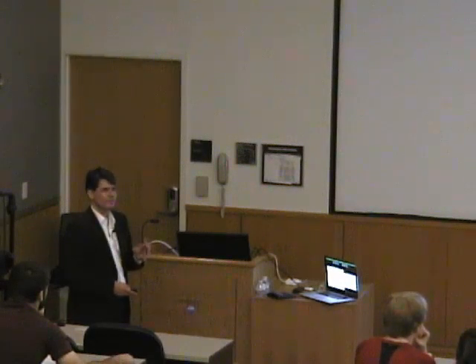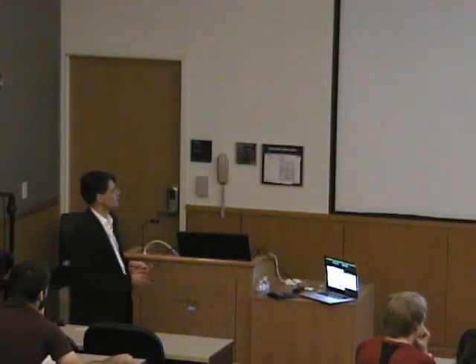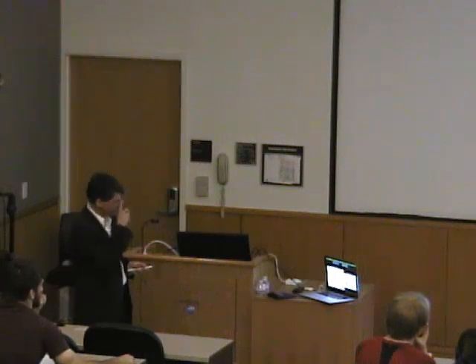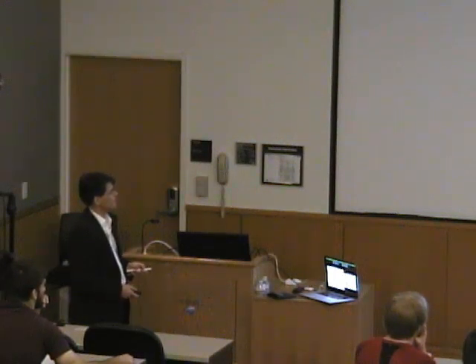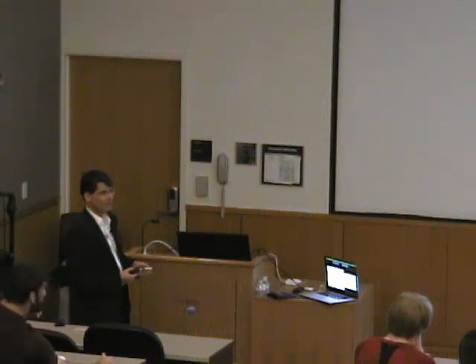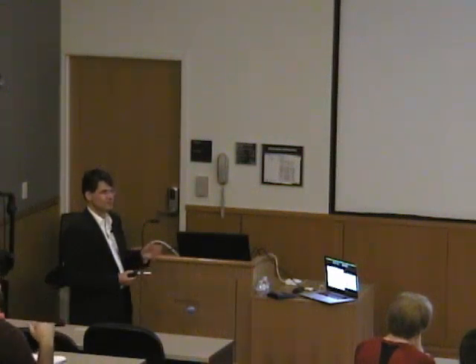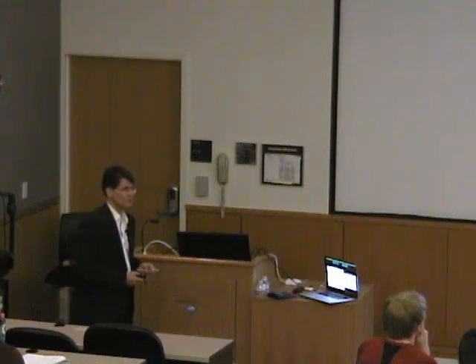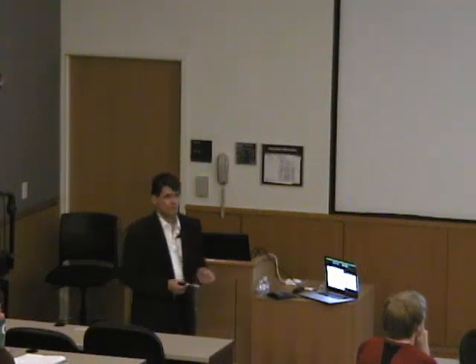And I want to only give you a glimpse with one example. And that is quite nice work that Ed Solomon has done with his co-workers over the years. He's figured out what the relationship is between these near-infrared transitions and the coordination geometry in high-spin iron 2 complexes. And that is an important thing, right?